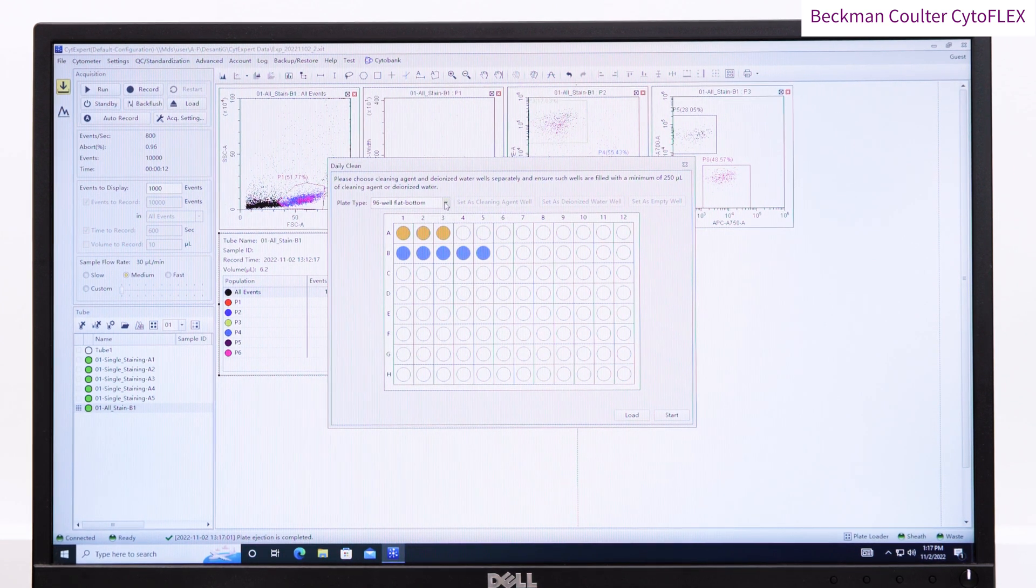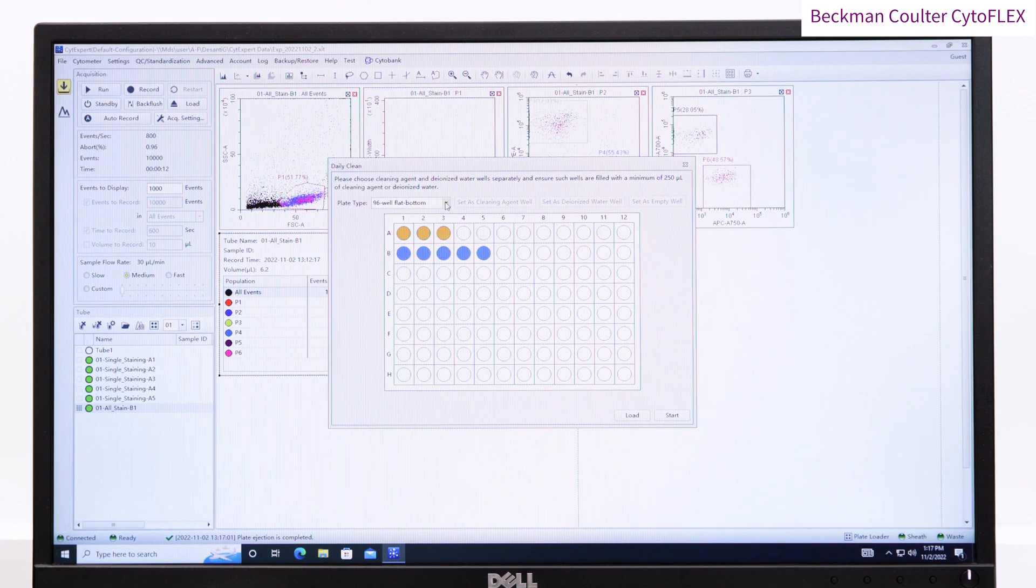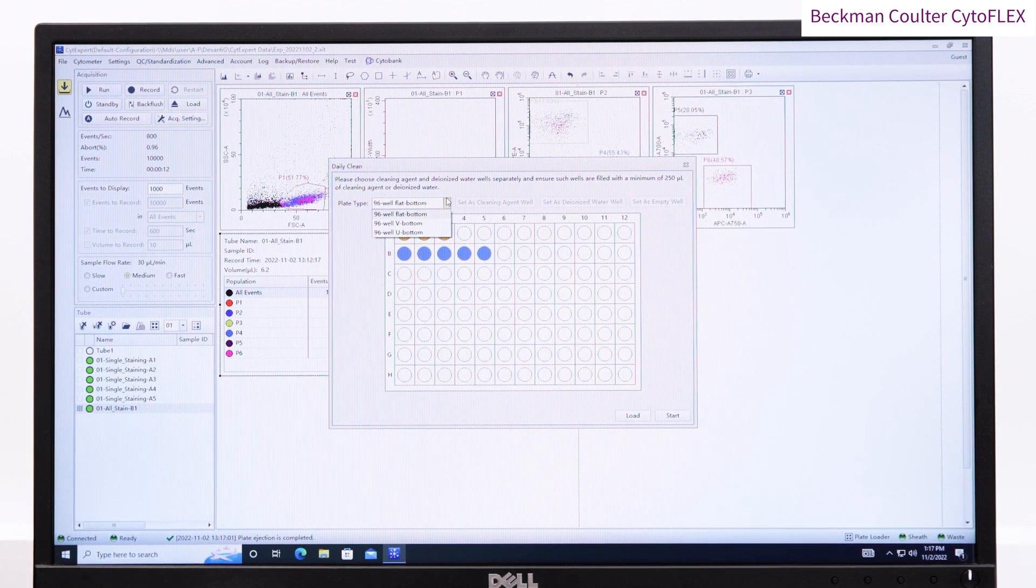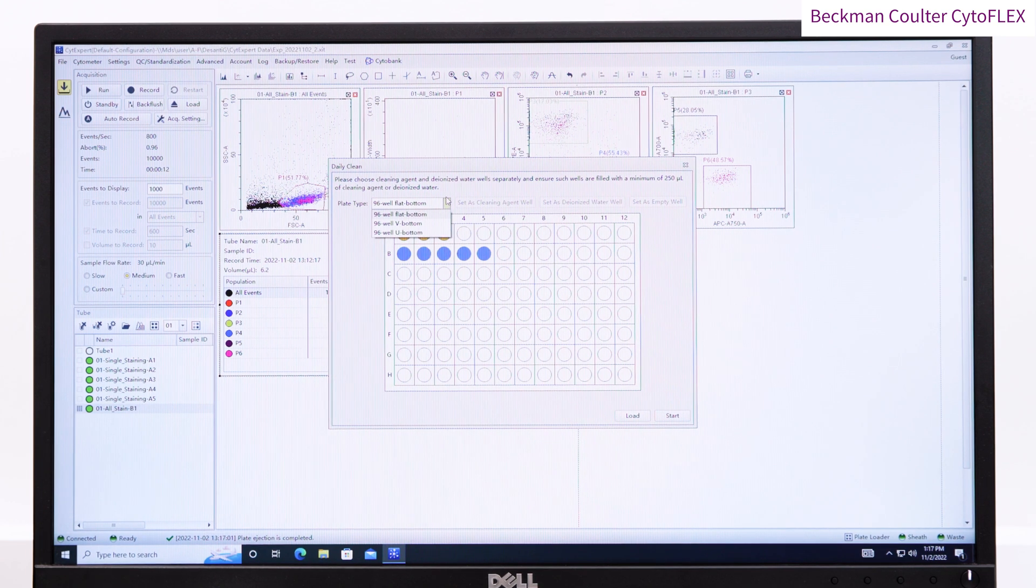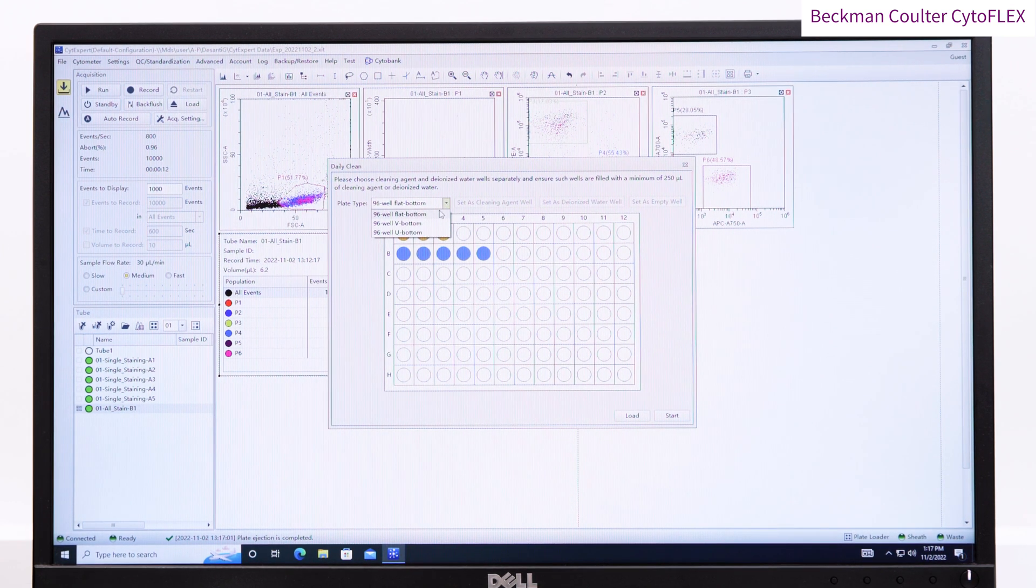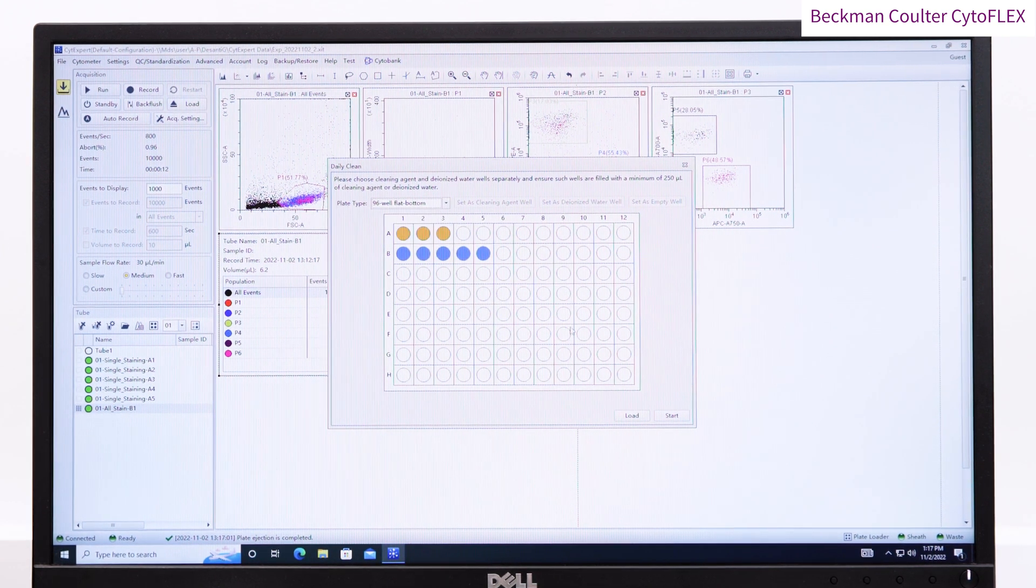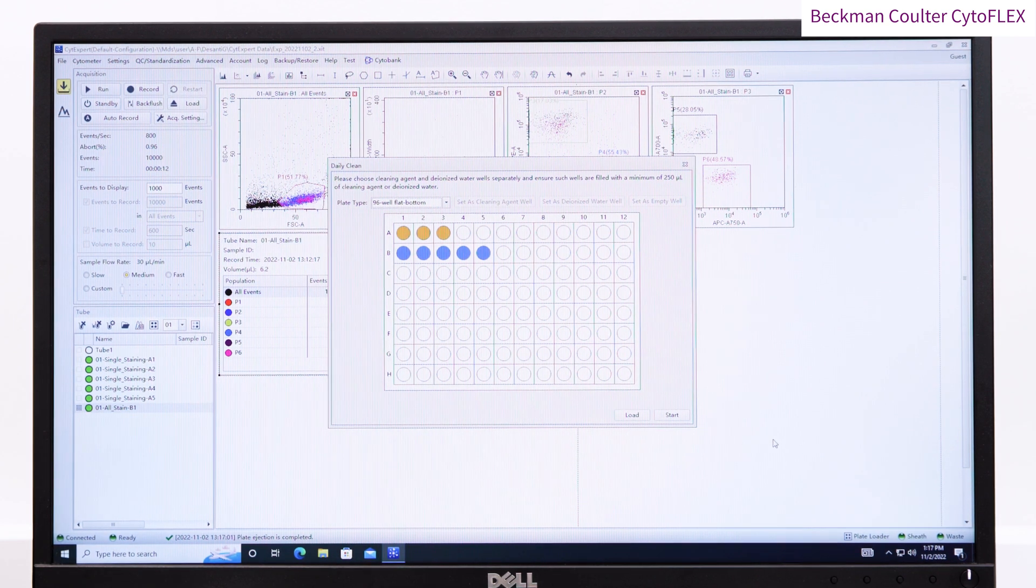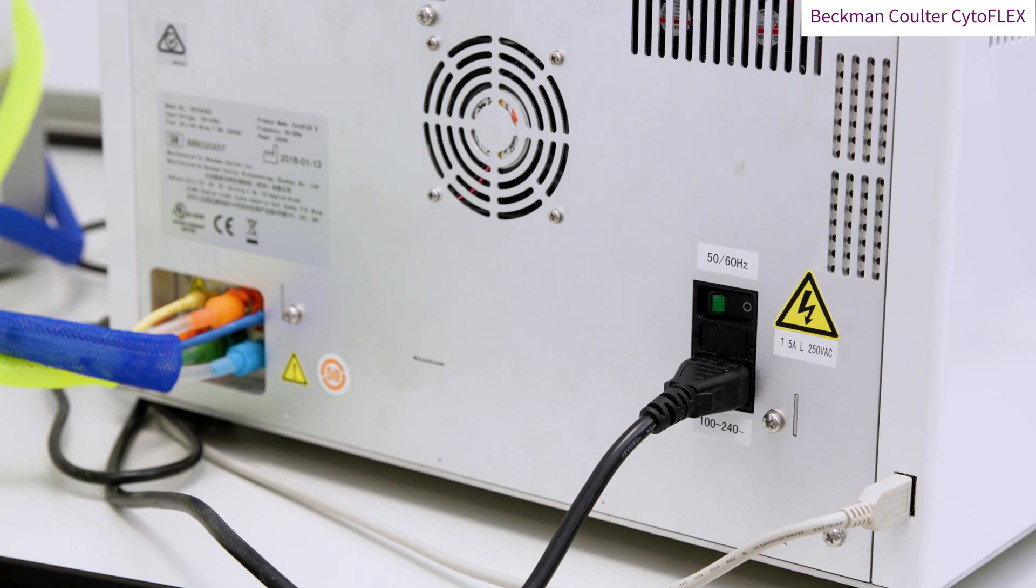Once finished, you can either log out and leave the machine on for another user, or to turn off, simply close the software. Turn the CytoFLEX machine off using the button at the back of the machine and close the PC down.